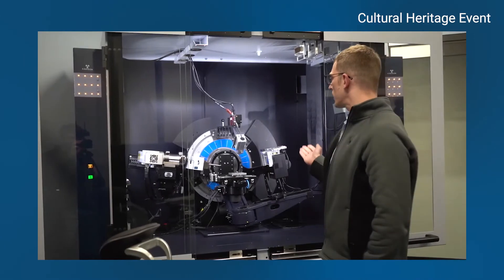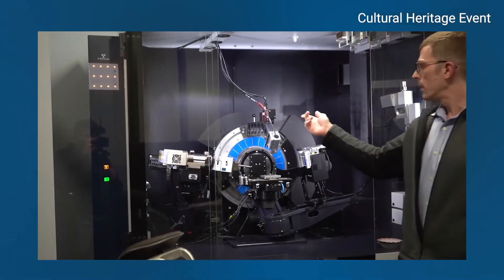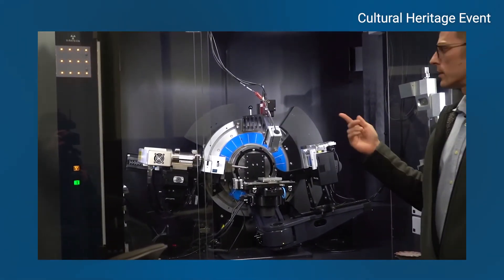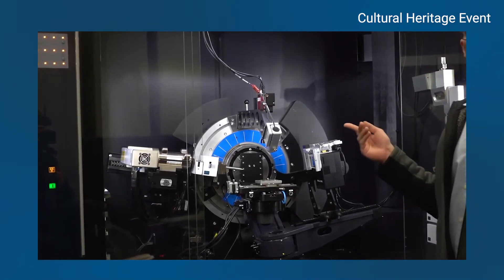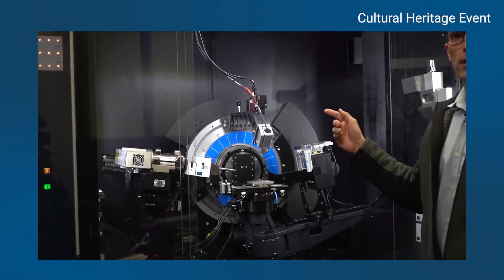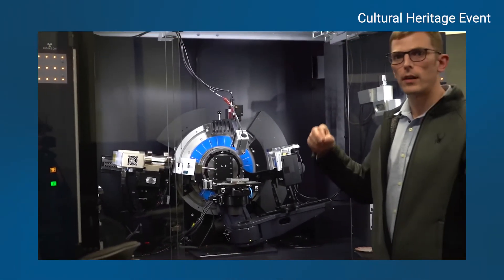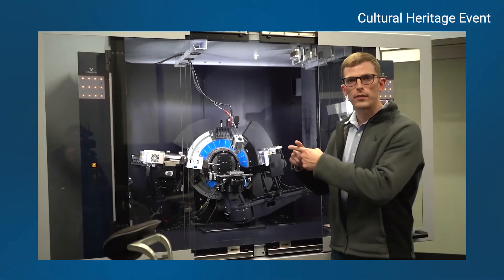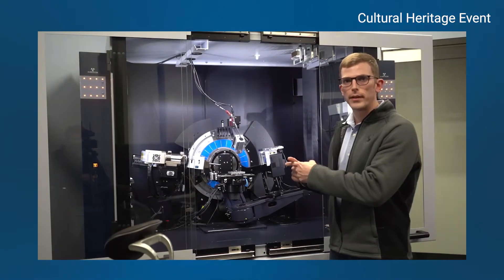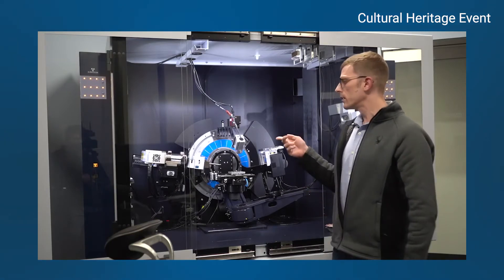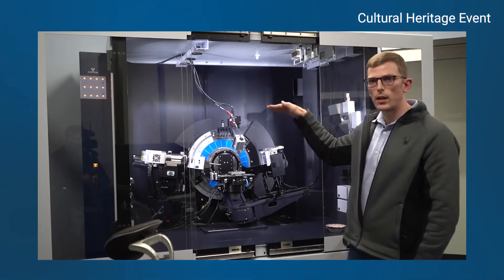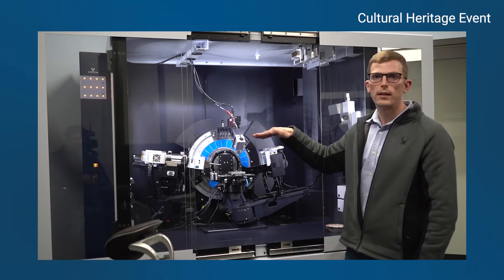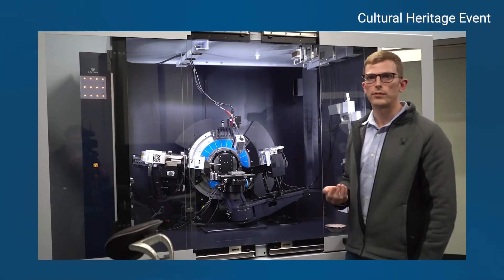And then finally, a laser video microscope. This is useful for sample positioning, as you'll see. This comes with a calibrated microscope image, so you can precisely target areas and know that the X-ray beam is hitting the center of the camera reticle. The laser comes in at an angle and helps you align the sample height to get accurate peak positions for phase ID.